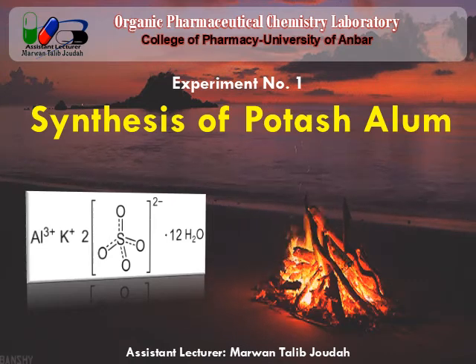Today's experiment is the synthesis of potash alum, الشب. This is its structure. We have aluminum, potassium, and the sulfate ion with 12 water molecules.